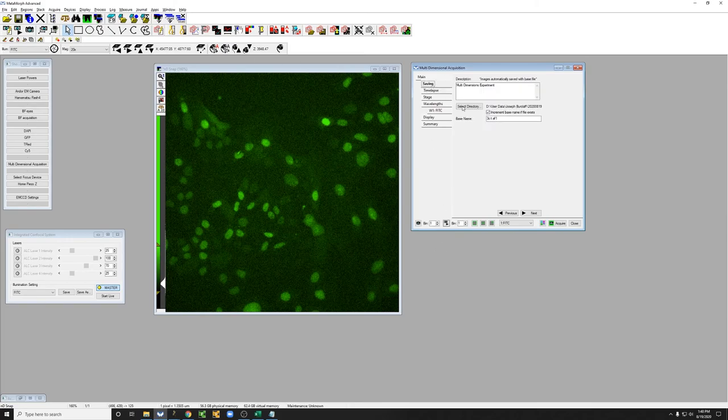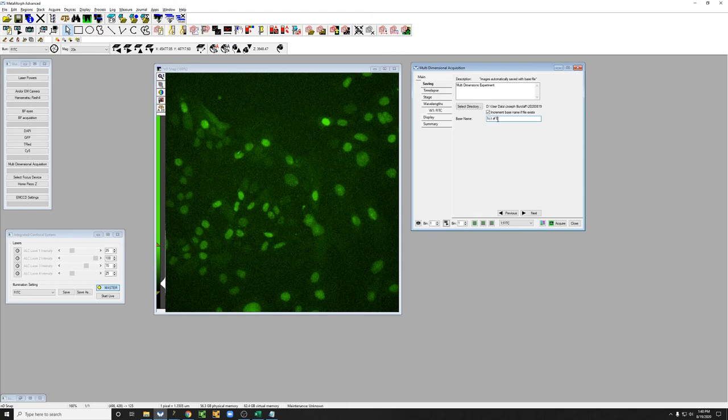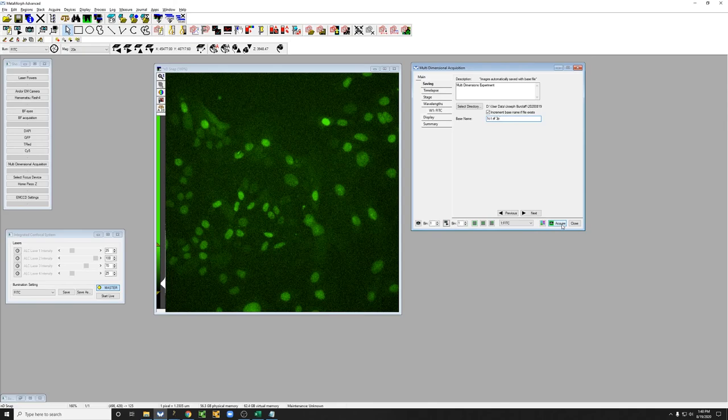I'm just going to go to saving, three channel, time lapse. So this is actually a one channel, time lapse, autofocus, three positions. This is just a simple nomenclature for me to know what I've done here. And I'm going to hit acquire.